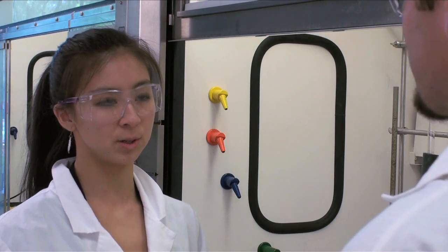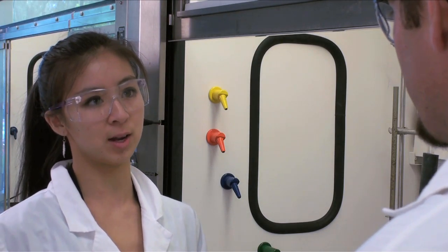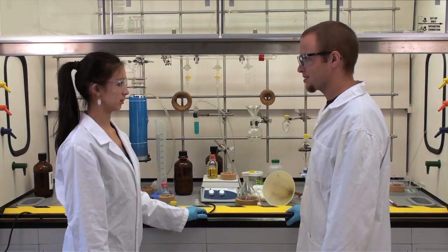Hey Gidget. Oh, hey Matt, I think I'm ready to run my reaction with tert-butyllithium today. I have all my protective gear on, and I made sure not to wear any clothing made of flammable synthetic fibers. Well, actually, we should upgrade our personal protective gear, and your hood is a mess. We need to clean it up so we don't have any interference, especially for a reaction like this. Okay.